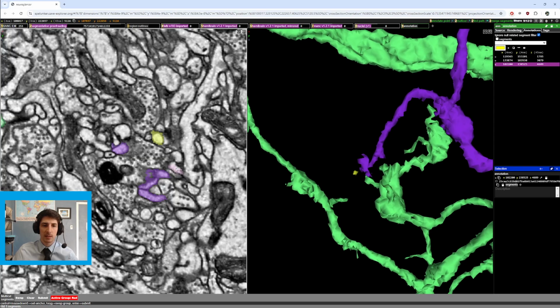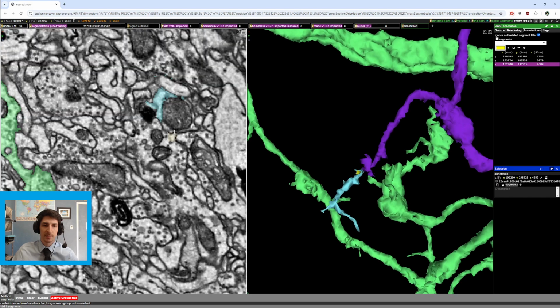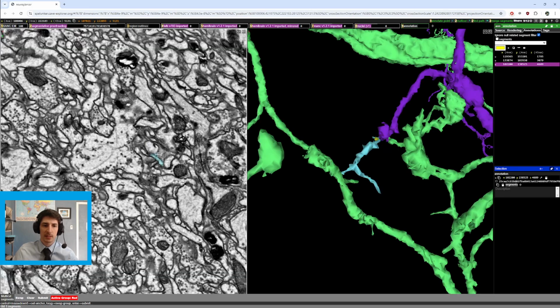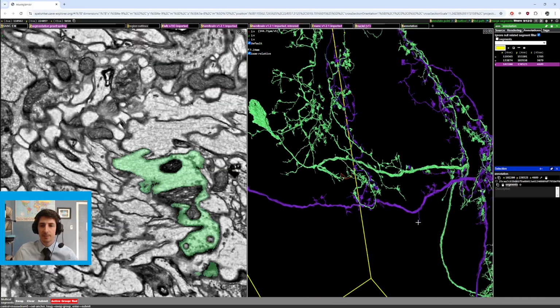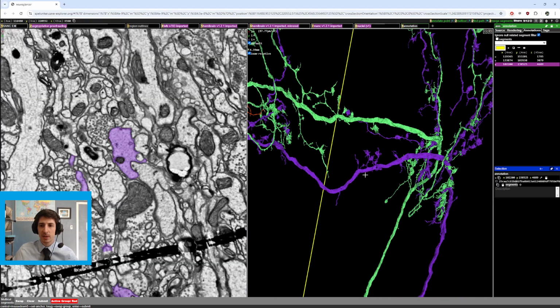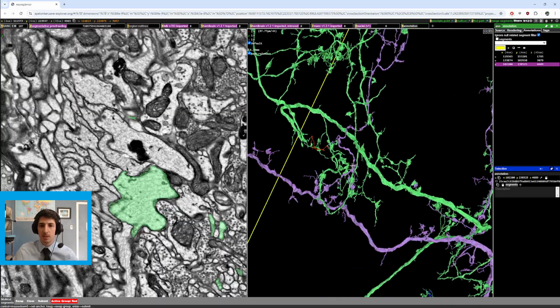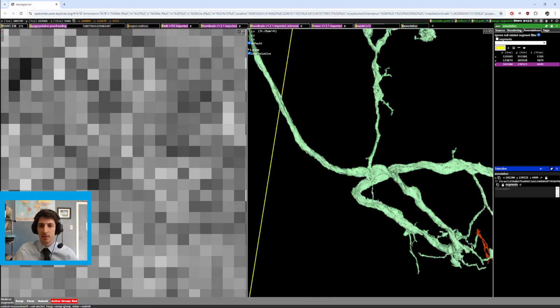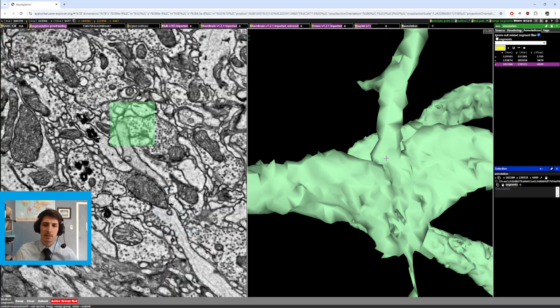Yeah, it looks like it is pushed to the side here. That's probably going to yield some extra stuff. Kind of small though. I would start by looking along the, this is quite a thick branch. And the green one has 1, 2, 3, 4. Or is this a merger? This is a merger.